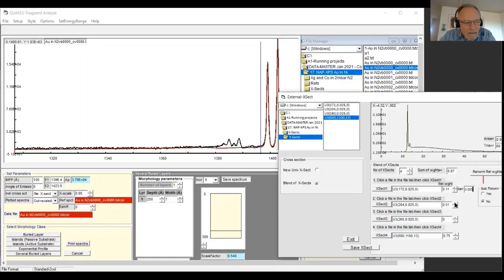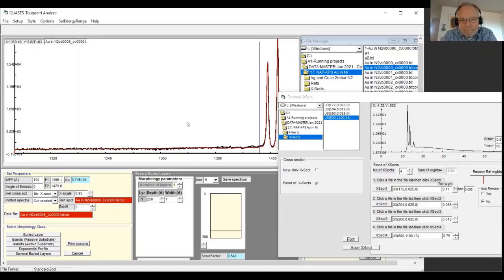Click up here, and what do we get? We get about 0.55. So now it's fairly smooth in this region as well. We have the peak out here, number 3, and we increase that. And maybe this is too much. It's about here. It's very close, smooth everywhere here. You could make fine adjustments of these values to get a little bit better account. You could also put in a small peak here. I'll not do that here, but you can do that.